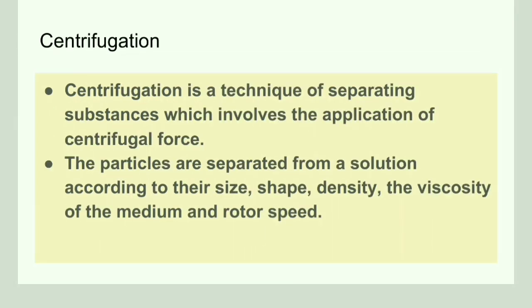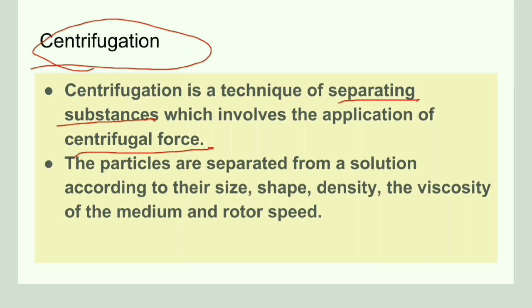So, what is centrifugation? Centrifugation is a technique of separating substances, and this involves the application of centrifugal force. This separation is based on the size, shape, density, and viscosity of the medium as well as the rotor speed.